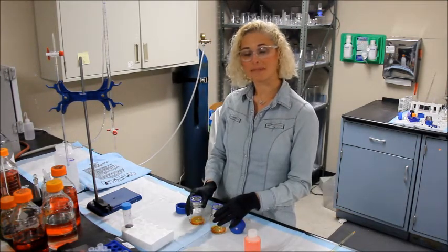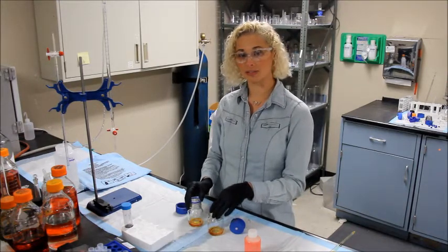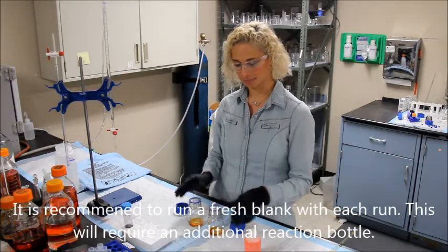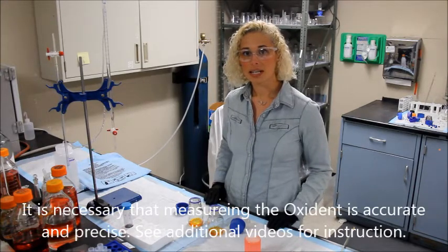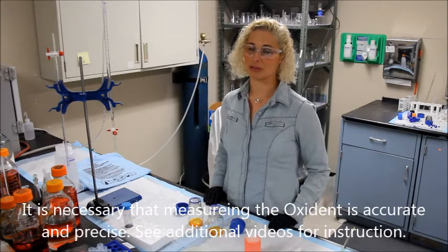We recommend running a fresh blank with each assay, so I filled two reaction bottles — one for my wine sample and one for my blank. It's important that this step is accurate and reproducible. See the appendix of the manual or more videos for further instruction.